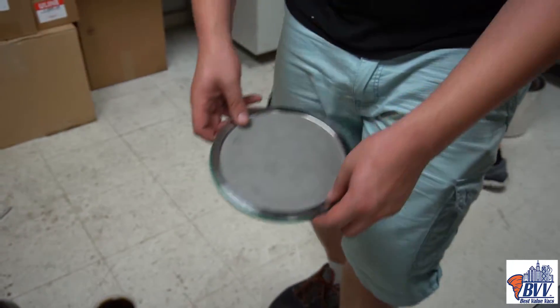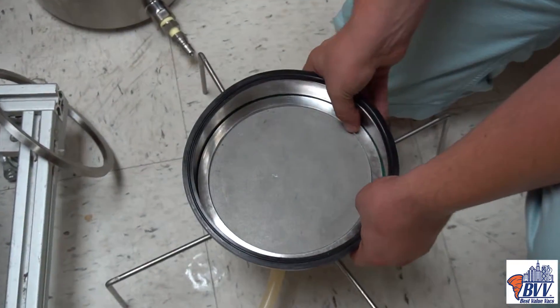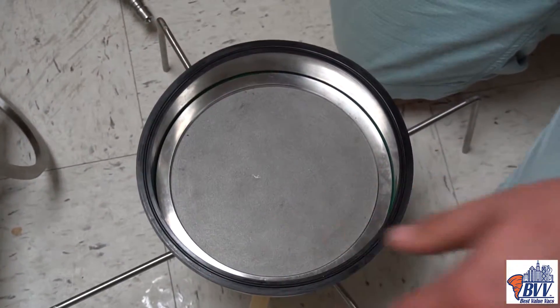The gasket allows it to tightly fit into a reducer and fit snug so that there's no blow-by when filtering.